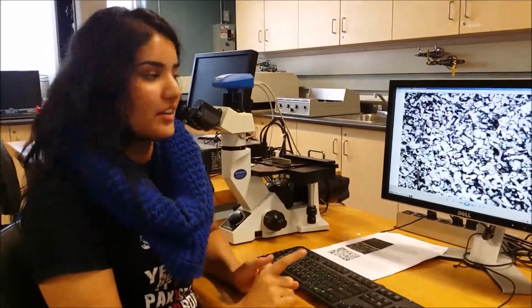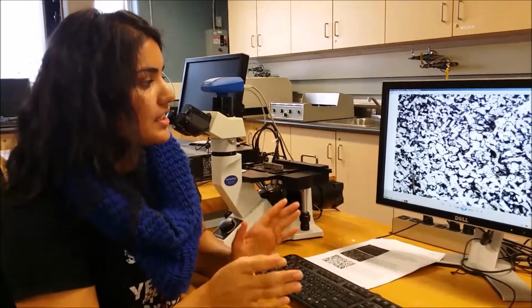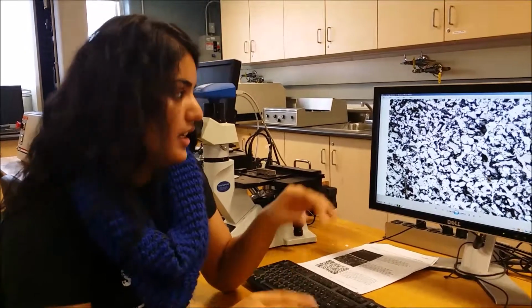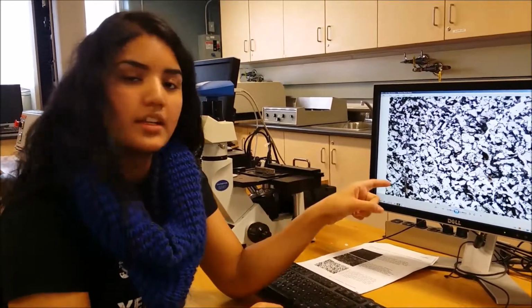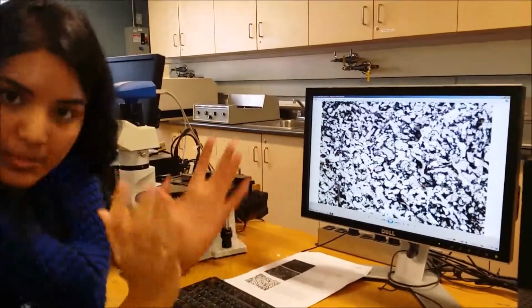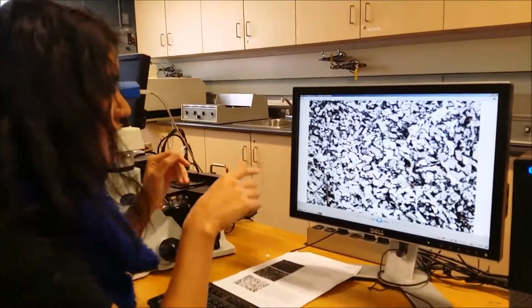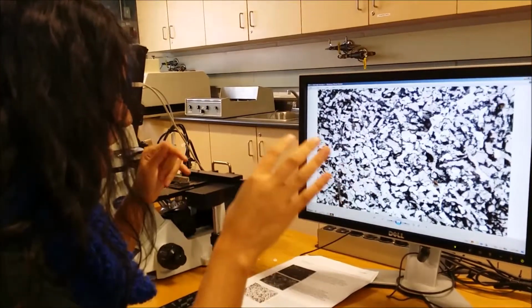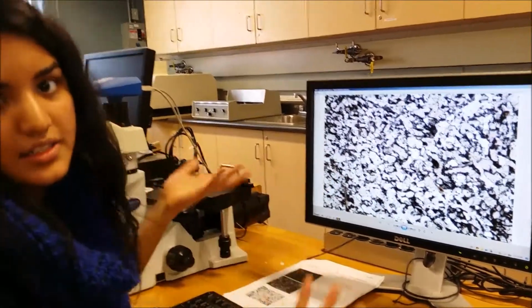So this part of the sample is the left side, getting closer to the low carbon content. And you can see more white, which is ferrite. So you can tell that it is closely packed together, and the grain sizes are getting smaller and smaller. Because of the close packed, dense grain structure, the hardness is going to be definitely hard.